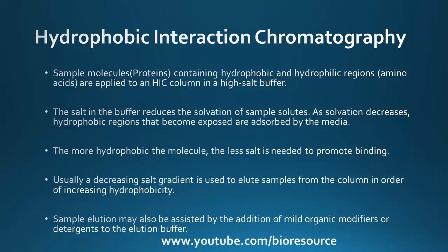The more hydrophobic the molecule, the less salt is needed to promote binding. So this is basically to expose the hydrophobic region in the molecule. That's the reason salt is used. So if the protein is more hydrophobic, then less salt is required to promote the binding.